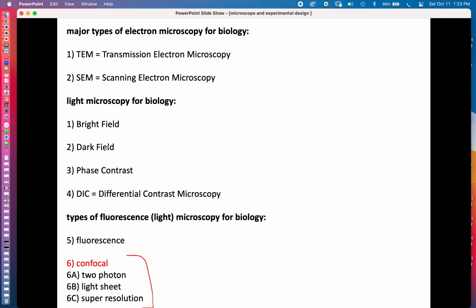So we've already talked about regular light microscopes, and then we talked about a fluorescent microscope that has just a staining strategy. These don't require a staining strategy to function, and sometimes they're used in combination with staining, a pigmented stain like that. And then this requires that staining. But if we just look at these, they have something in common that this confocal microscope fixes.